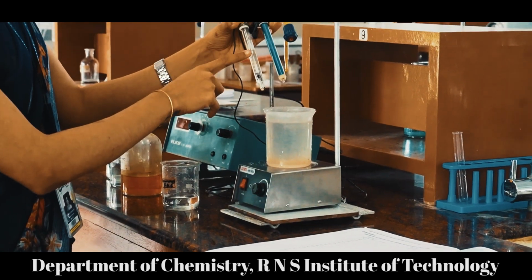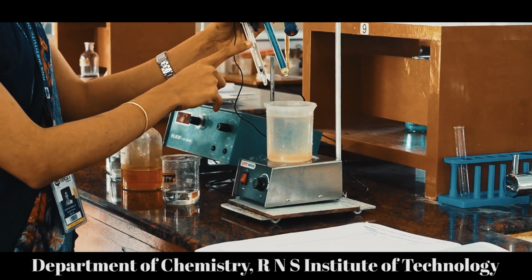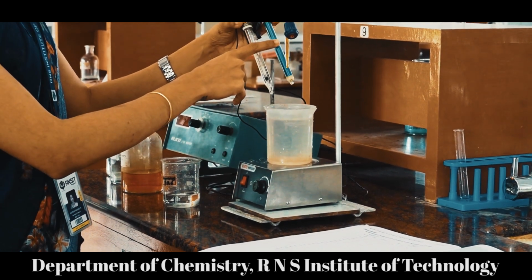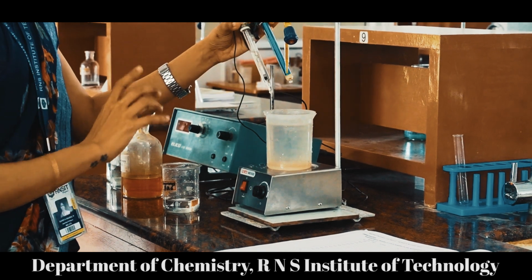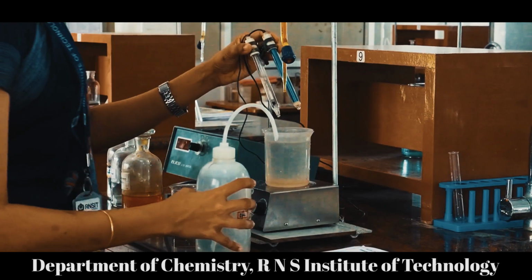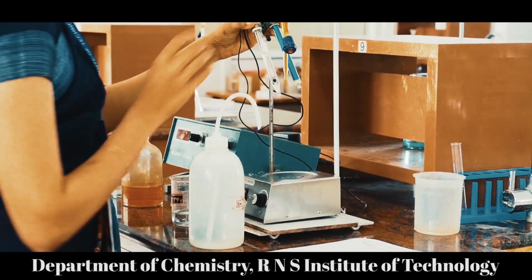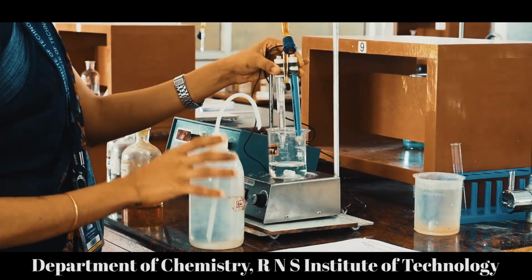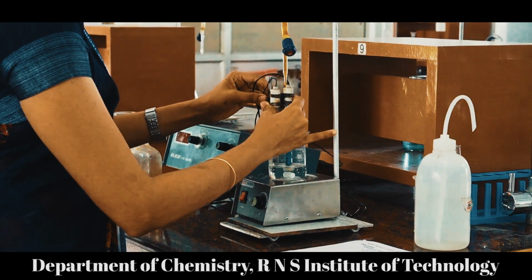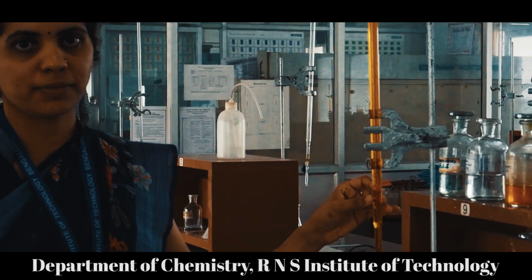Here this is the calomel electrode and this is the platinum electrode. Remember, calomel is a reference electrode whose potential is already known, and platinum electrode is an indicator electrode. This is also called a redox electrode. These electrodes are washed and placed in the FAS solution. In the burette, we have taken K2Cr2O7 solution.